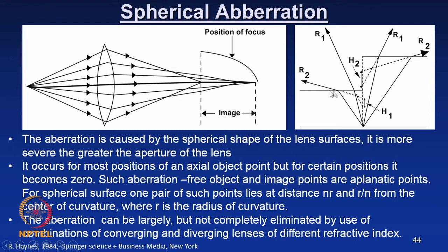Similarly, in this image, the cover slip on the specimen is normally kept at a specific thickness, about 0.17 mm. If you do not have this designed 0.17 mm cover slip, or if you have an arbitrary thickness of cover slip, then what happens to the spherical aberration? That is what is being illustrated here. The rays emanating from the specimen surface get refracted by the cover slip in this manner.